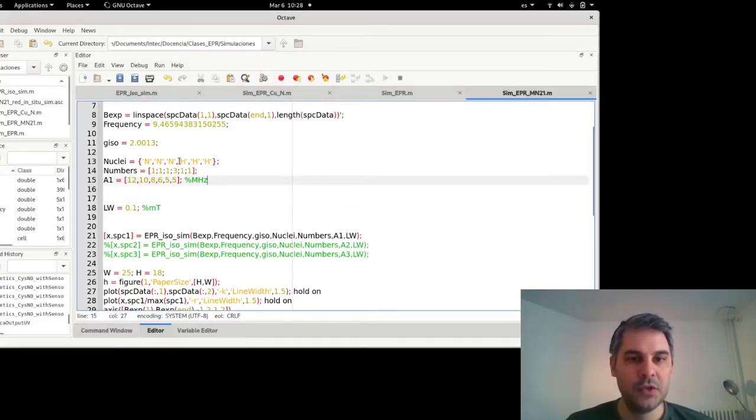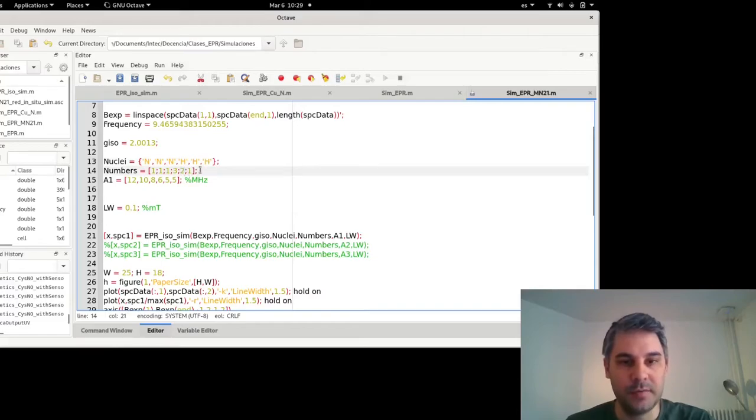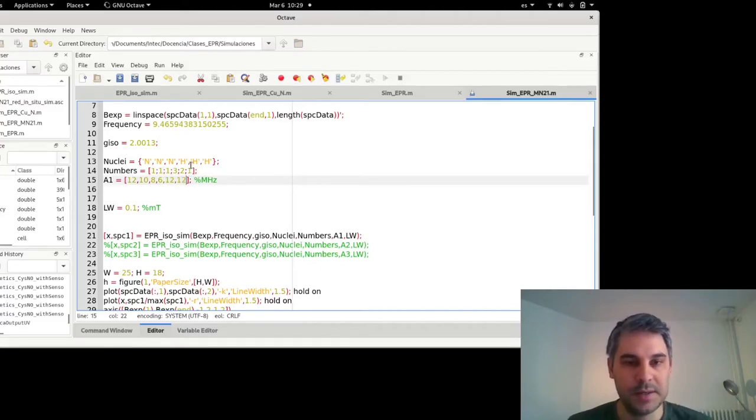So I also know the 3 nitrogens are different and they come from a triazole, and these 2 hydrogens appear, because of calculations, to come from the ortho and para hydrogens in a phenyl molecule. So the ortho, I have 2 of those, and I will increase these values. The para has only 1 hydrogen.